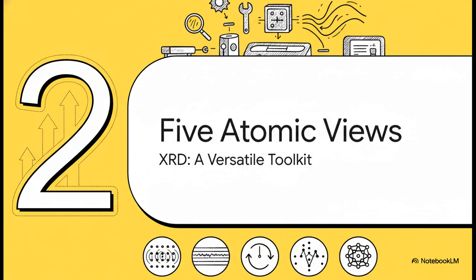So now that we've got the basic idea down, let's see how this actually works in the real world. You see, XRD isn't just one measurement. It's more like a whole toolkit. And each tool, each scan, is designed to answer a totally different question about a material's structure. We're going to walk through the 5 essential scans you need for analyzing thin films.